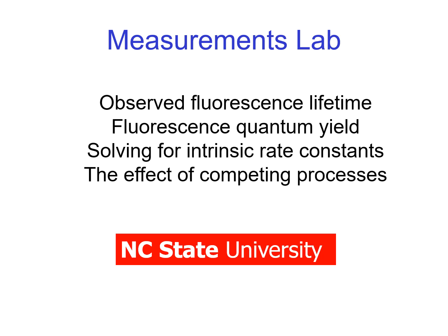We consider here how to obtain the rate constants for molecular processes, such as the decay of an excited state. It turns out that we need more than one instrument to measure the fluorescence rate constant. Specifically, we need to measure the observed lifetime and the fluorescence quantum yield. This procedure will be crucial to your laboratory experiment in class.